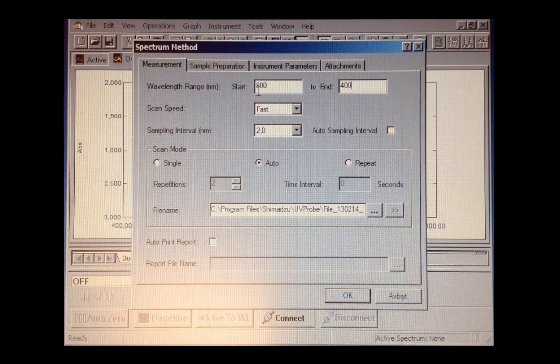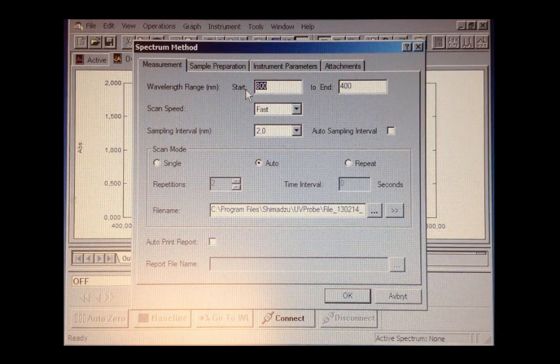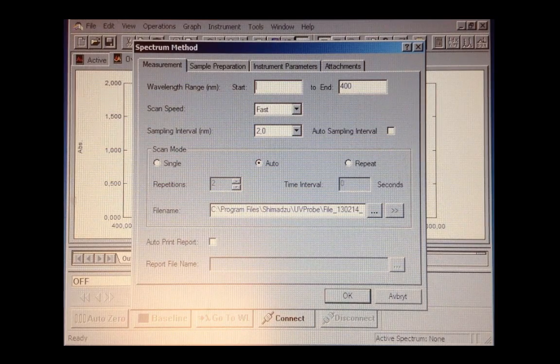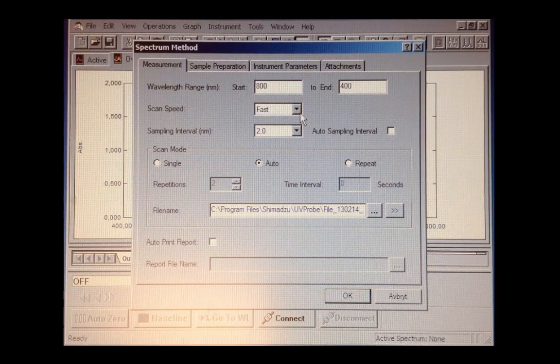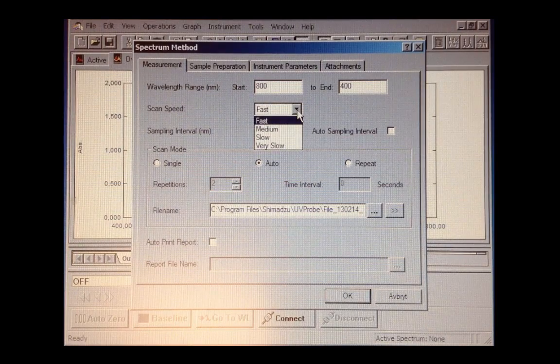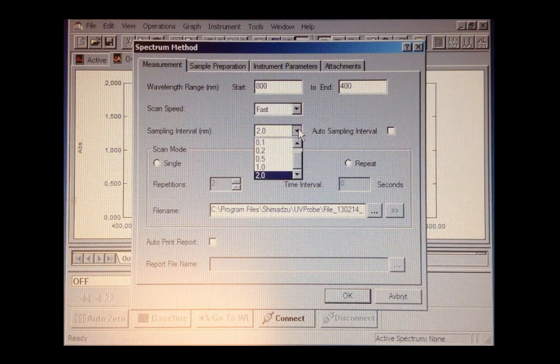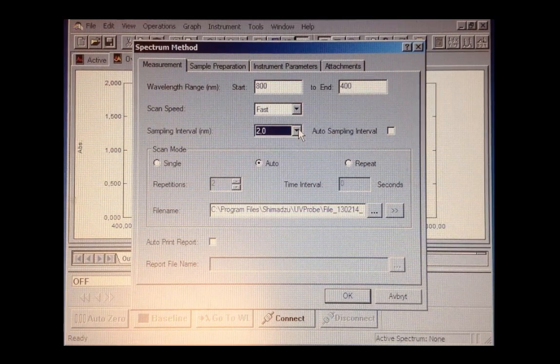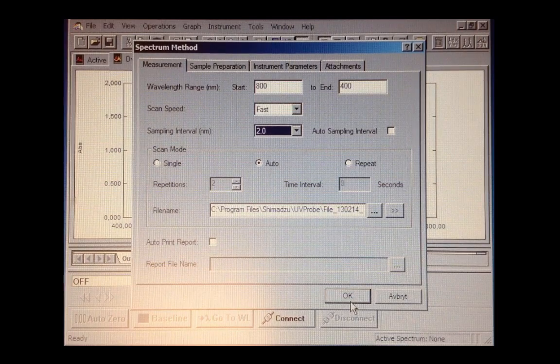For example, you need to set a wavelength range from which wavelength to which wavelength. Here we select 800 to 400. You can select scan speed or the sampling interval from 2nm to 0.1nm. And you can save your files to some folder.